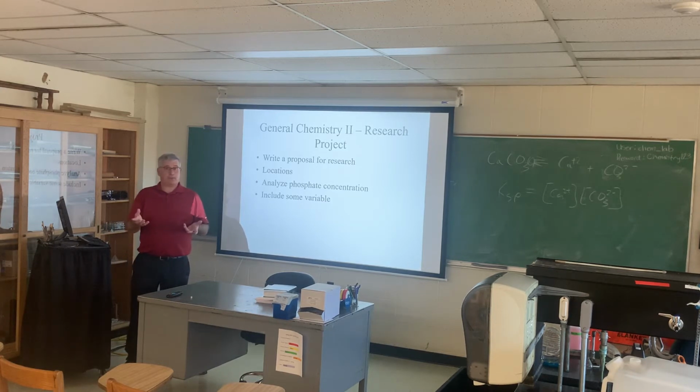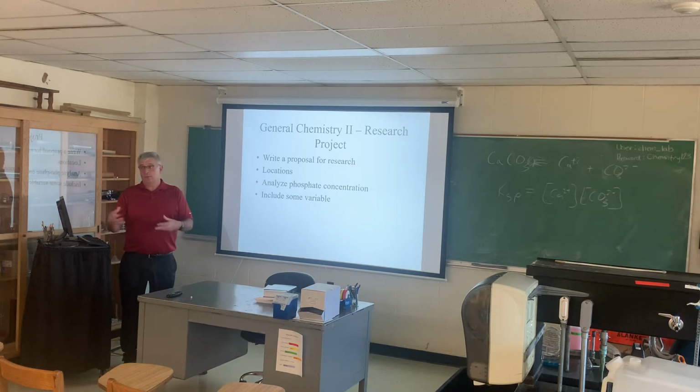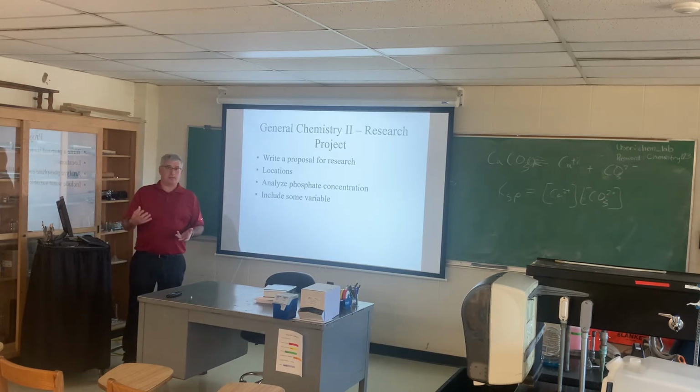We actually do a couple other labs connected to it. We do the analysis of phosphate this week in laboratory, the physical experiment that we're going to do. So when we write our research proposal, we can put in a methodology that we're going to use to analyze for the phosphate. And so you'll practice that. And then actually next week, we're going to do calibration curves from Beer's Law on another molecule. And so we'll look at it in solution and its concentrations, just so you get a chance to practice building calibration curves. And then the following week, we're actually going to do an analysis of phosphate in fertilizer.